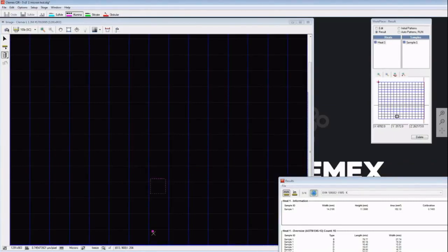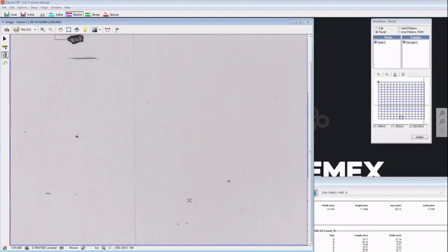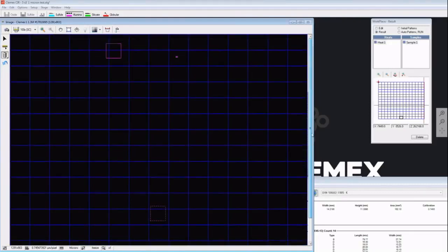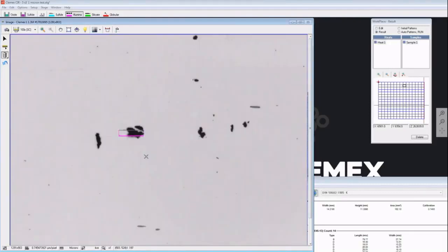On the bottom here, I'm going to look at it. This is dirt. There is another one. I'm going to look at it. You're going to notice that this was detected because of its rough shape. As I told you, alumina has a characteristic to be a rough-shaped inclusion, but the operator knows that this is not an alumina inclusion. This is actually bad preparation.